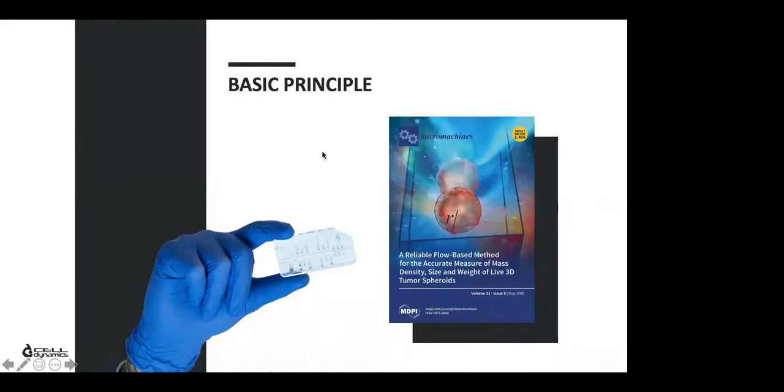This is the paper we have recently released in Micromachines Journal. It covers all the details of our theoretical approach and the basic principle of the device, so you can get the free full text access anytime you want for more information about the basic principle of the device.